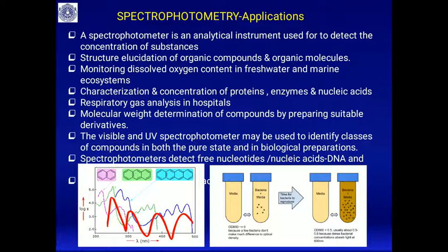We can also monitor the dissolved oxygen content in fresh water and in marine systems using this spectrophotometer. Then characterization and concentration of proteins, the amount of enzymes dissolved in the solution, the amount of nucleic acid, DNA dissolved in the solution. All these we can measure by setting different wavelengths. Then the measurement of respiratory gases in hospitals uses the spectrophotometer. We can also determine the molecular weight of compounds by preparing suitable derivatives.